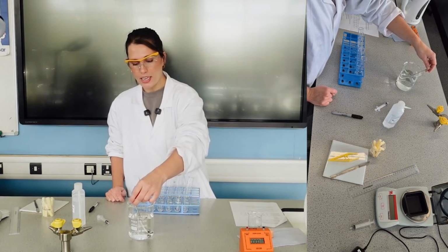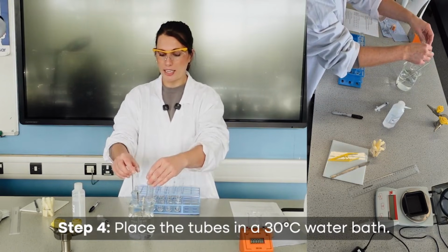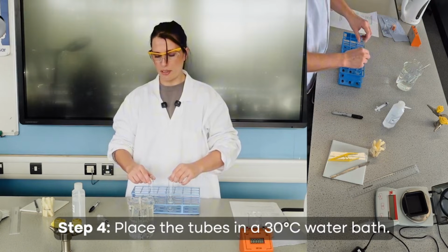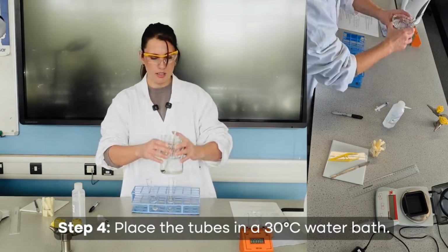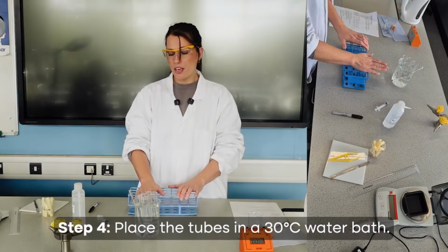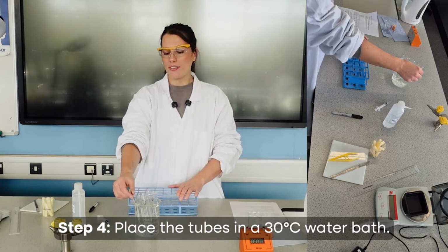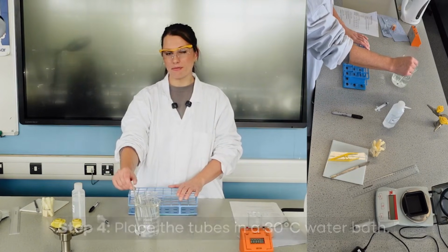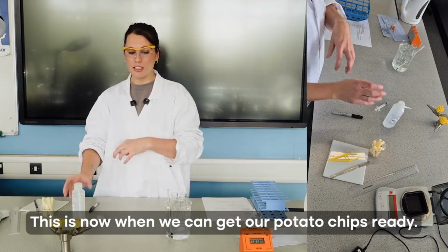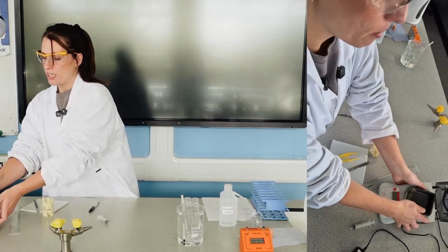So I've now got mine down to temperature. And what I'm going to do next then is place my boiling tubes into the water bath. And yeah, even mine there is too full. So I'm going to leave those to all come to the same temperature, which will probably take about 5 minutes, and they need to check that with their thermometer. Now, while that is reaching temperature, this is now when we can get our potato chips ready. So I would suggest they set that up first, and then at the same time, we can be doing this.